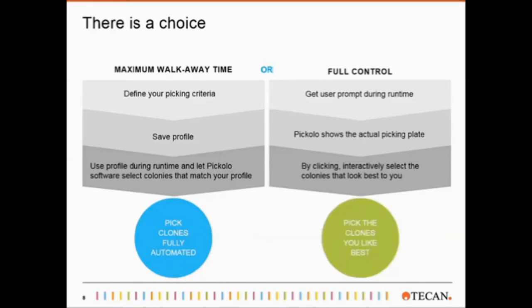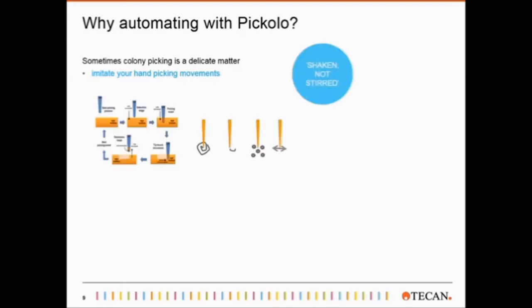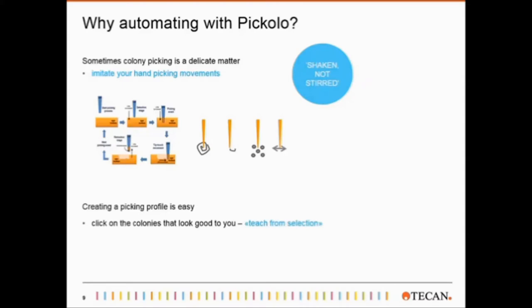But why automating with Piccolo? Sometimes picking is a delicate matter, and it is not sufficient to simply stab the colonies. The beauty of using colony picking on a liquid handler is that the full liquid handler software can be used to define the picking process, and it is possible to really imitate hand movement. Like shown here, a scratch movement where the tip detects the agar surface, goes 1 mm into the agar, scrapes sideways while aspirating, and then moves back out again. But also little sideways movements or something like a multi-stabbing is easily possible to get as much material as possible. And the Teach from Selection function makes it easier to create picking profiles by just clicking on the colonies that look best.